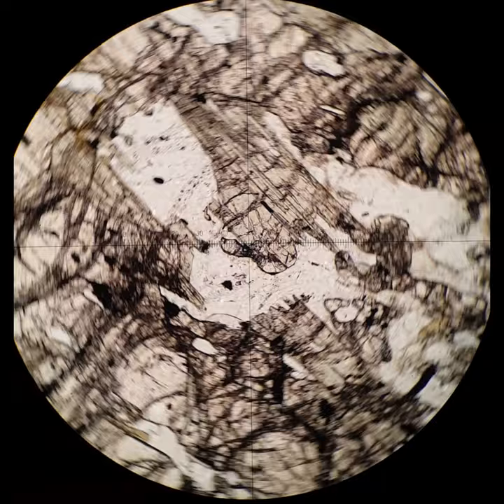Now, this is gedrite. This is an inclusion inside garnet. It has some pleochroism. That's one way we tell that it's gedrite. But what you'll see is that when the cleavage planes, which are those thin lines running east-west, are parallel to the crosshairs, then it is extinct. Again, an orthoamphibole.